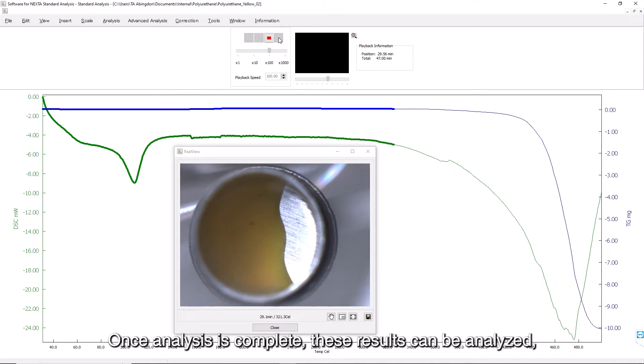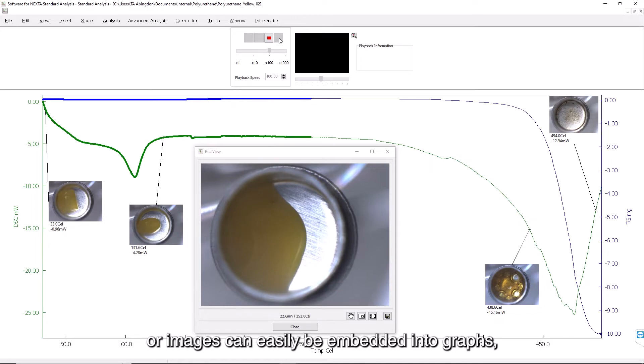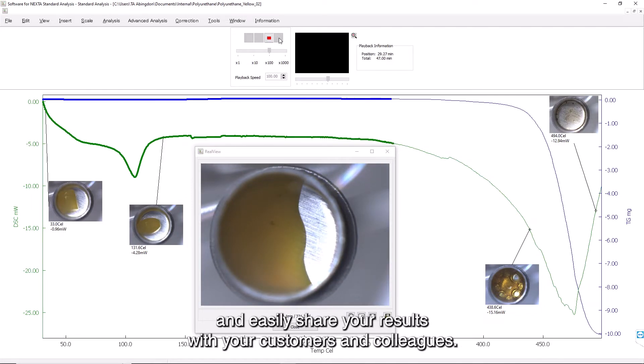Once analysis is complete, these results can be analysed with replayable videos of the sample in action, or images can easily be embedded into graphs, allowing you to fully understand the materials you're analysing and easily share your results with your customers and colleagues.